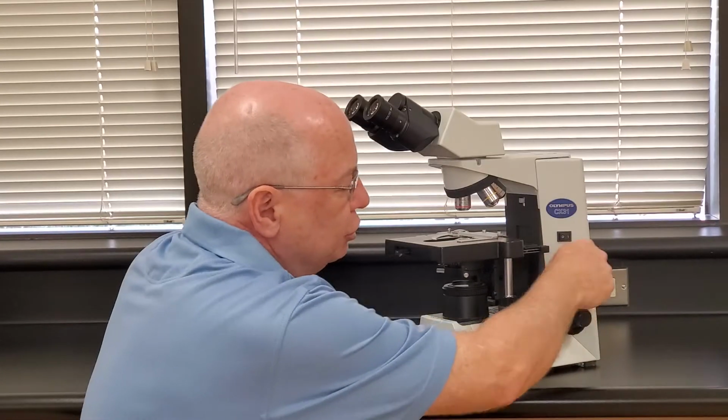Now, most students turn it all the way up. They look through here and they get blinded. So you turn it up about halfway. If you need more light, you can add it. If you need less light, you can turn it down. So turn it up about halfway. Plug it in, turn it on, turn the light up to about 4.